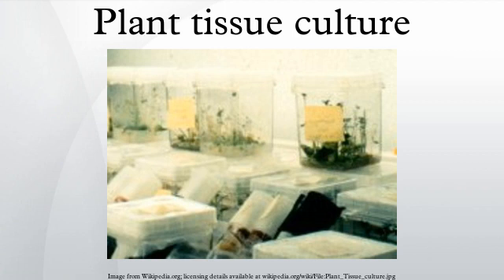The production of plants in sterile containers that allows them to be moved with greatly reduced chances of transmitting diseases, pests, and pathogens. The production of plants from seeds that otherwise have very low chances of germinating and growing, that is orchids and nepenthes. To clean particular plants of viral and other infections and to quickly multiply these plants as clean stock for horticulture and agriculture.